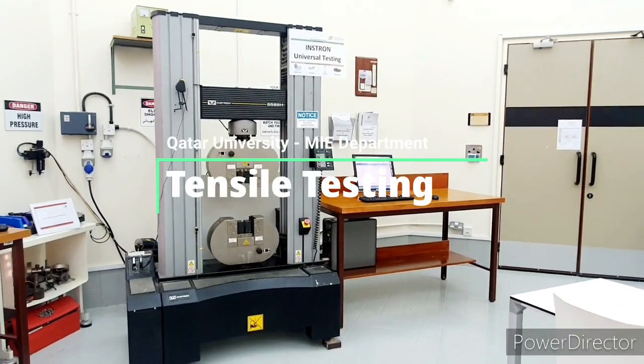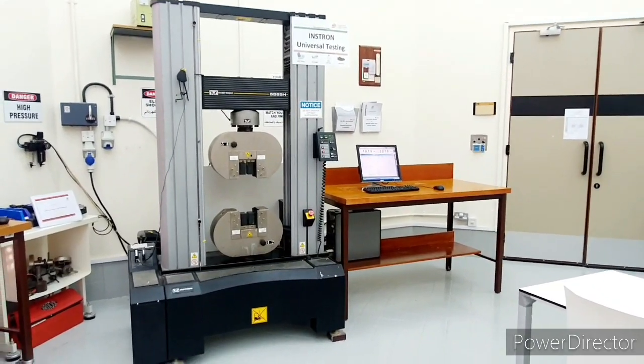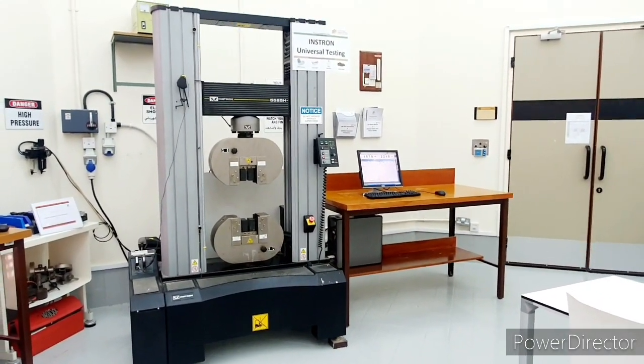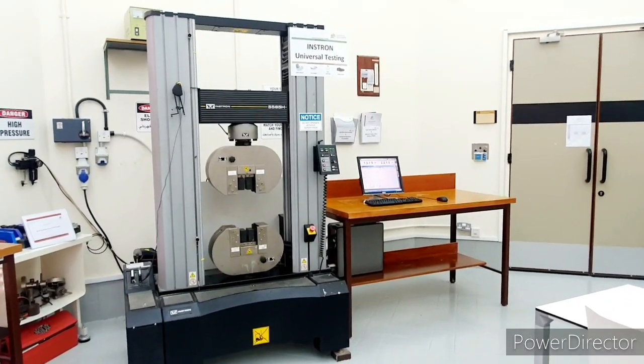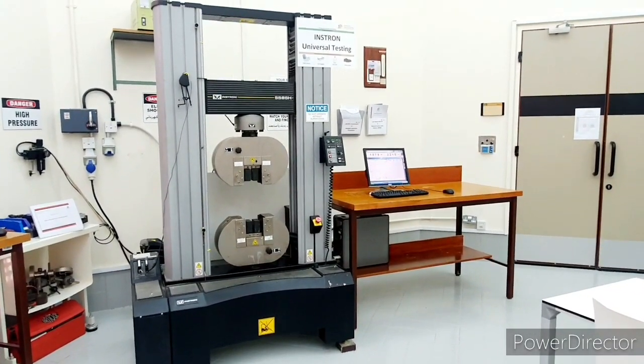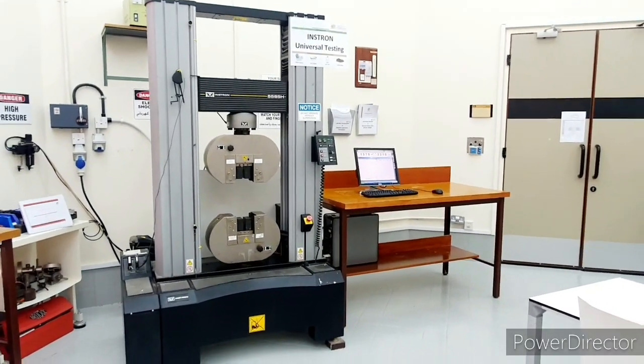Hello everyone, this is the Instron universal testing machine which we will use for the tensile test today. We will carry out the test for 3 different samples, 3 different materials, and how this will be done, we will go through this procedure now.